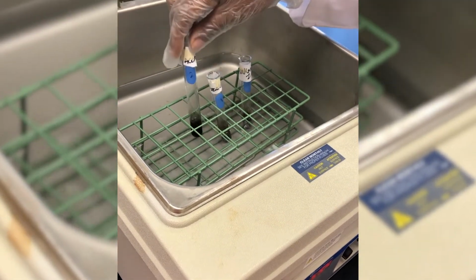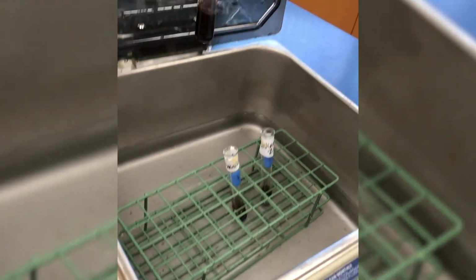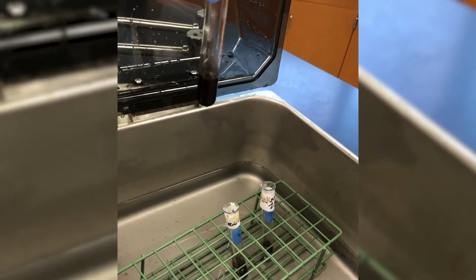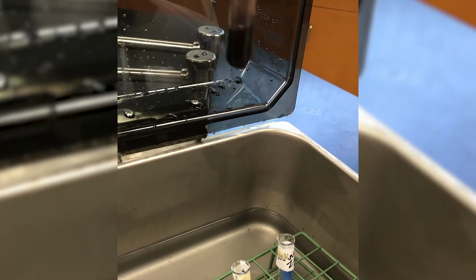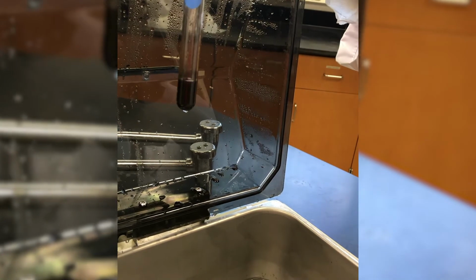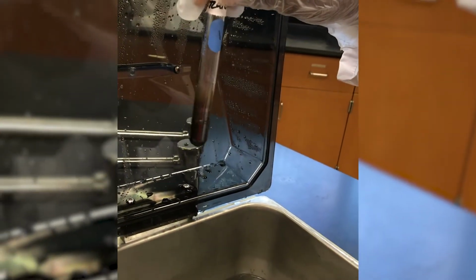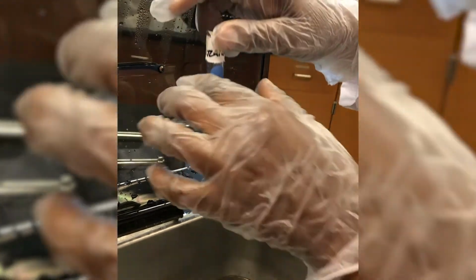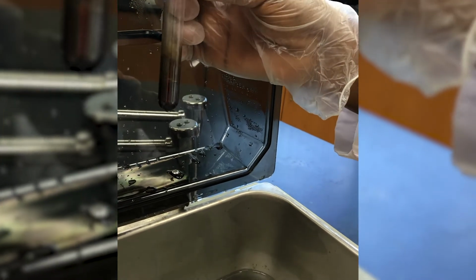Remember, we tested acetone. We added Tollens reagent to acetone, and then we're supposed to put it in a hot water bath at 60 degrees for about 15 minutes. We've waited now for about 15 minutes. So this is what our acetone in Tollens reagent looks like after the 60 degrees hot water bath for 15 minutes. This is what the benzaldehyde looks like. And we know that our benzaldehyde has the functional group of an aldehyde.